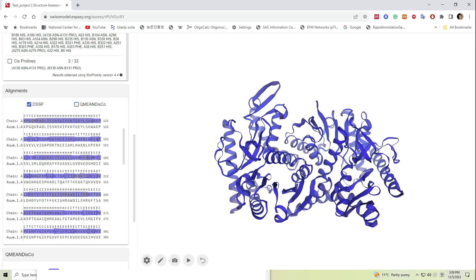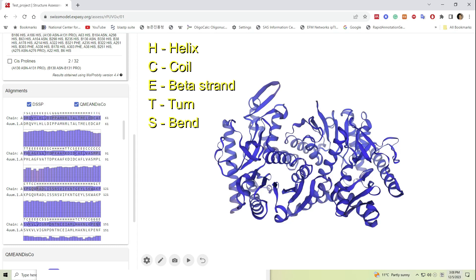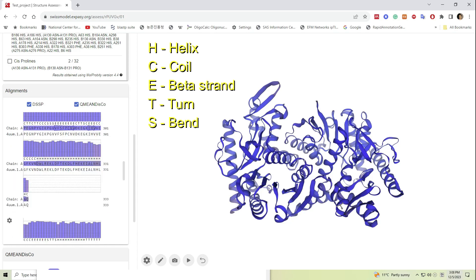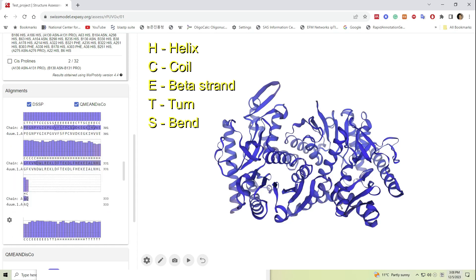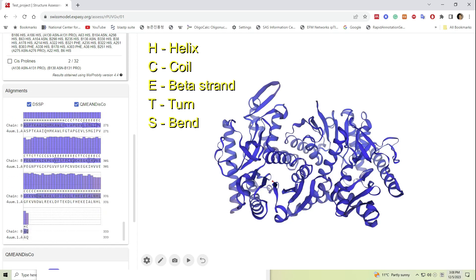Here DSSP stands for the defined secondary structures of proteins. Here C stands for coil, E stands for beta strands, T stands for turns, and S for bends.